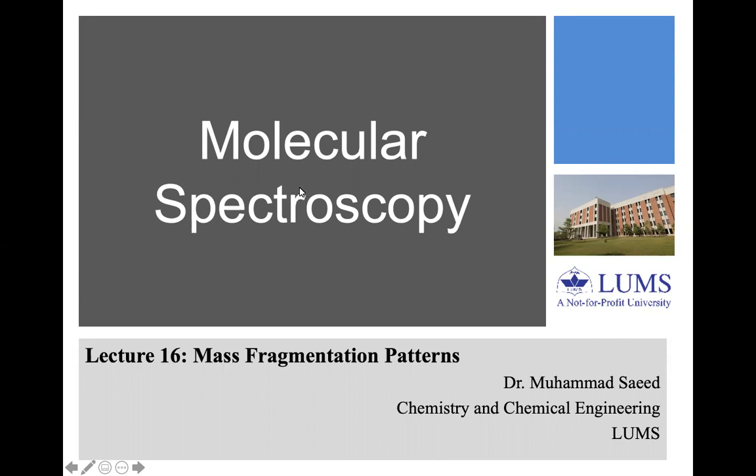In today's lecture, we will discuss some mass fragmentation patterns. This is a very important skill as far as the structure elucidation by mass spec is concerned. So I encourage all of you to perform with me when I'm doing some structural analysis and mass fragmentation mechanisms.